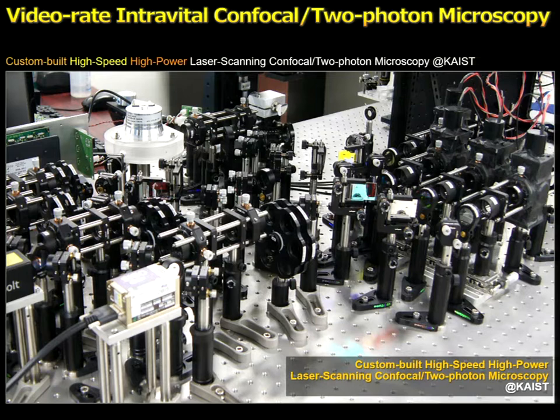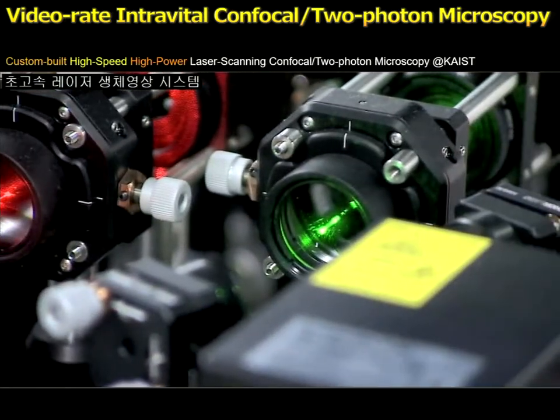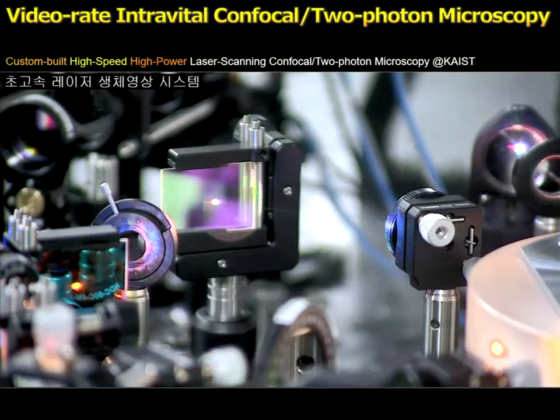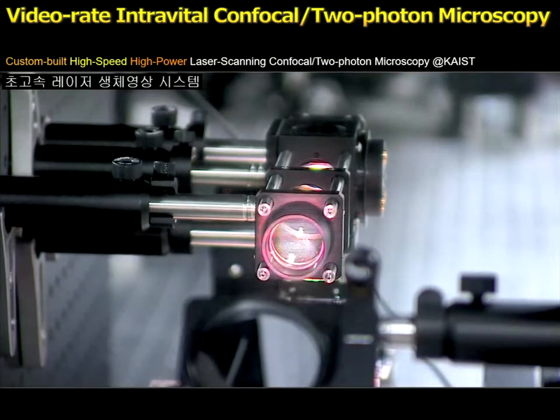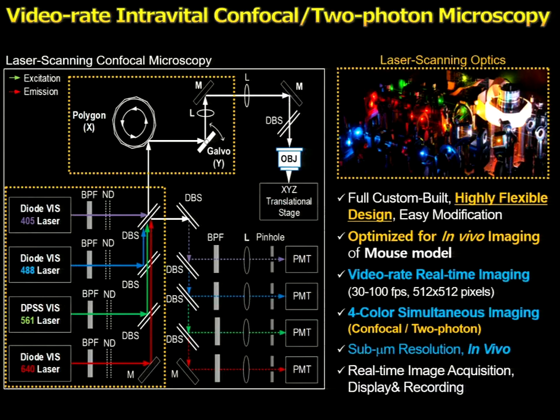So these are the lasers. You can see the mirror, lens, filter, and detector. These are the laser scanner and the electronics. And then we have a stage in here. So this is an open system, actually, so we can see the laser beam coming out. We combine them into one position and then make a scanning pattern and then deliver it into the mouse tissue and then get the images. So again, this is a full custom build. So depending on the application, we can easily modify this system. So it's a very flexible system.